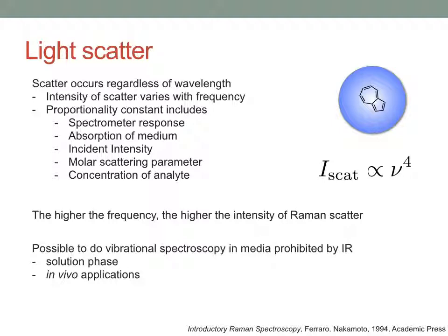The other real benefit for Raman over infrared is that I can do it in the solution phase. Because I'm often looking at visible light to get my Raman scatter, it's not absorbed the same way as it would be if I was looking down in the infrared. So if I was in aqueous solution in the infrared, all I would see is a great big absorption from that OH vibration in the water. You cannot do infrared in water.